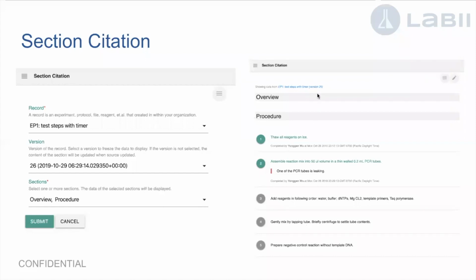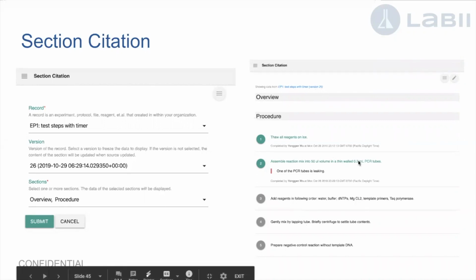It's actually specific to one version. It will only display this particular version. Even if that protocol is updated, you still see the same content, because this is what you did at that particular point in time.